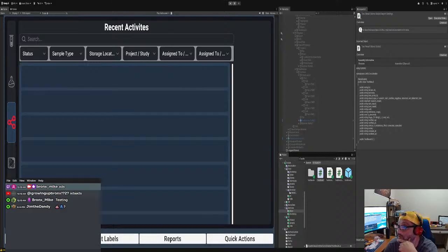Like we're gonna say, get samples per patient ID, or yeah, you see what I'm saying? Or we get all the patients associated with a sample type. Yeah, stuff like that, right? So whenever you write a service, you need to write methods for it. Okay, does that make sense? Right? Oh, okay, all right.